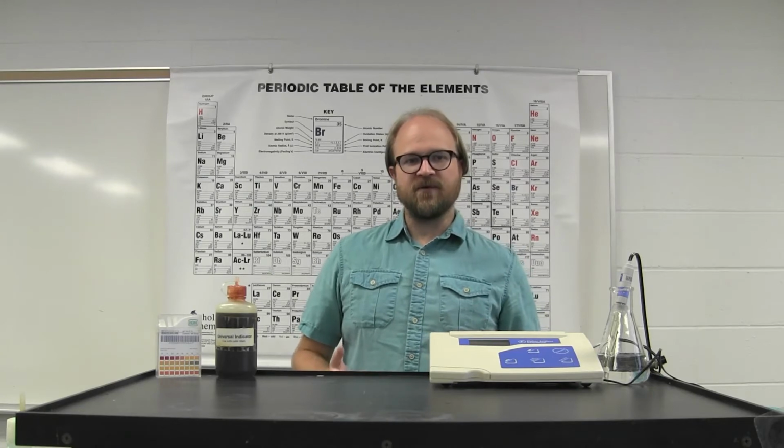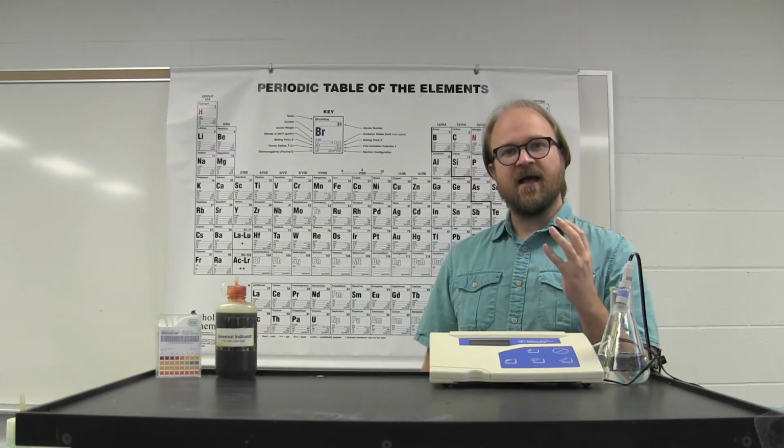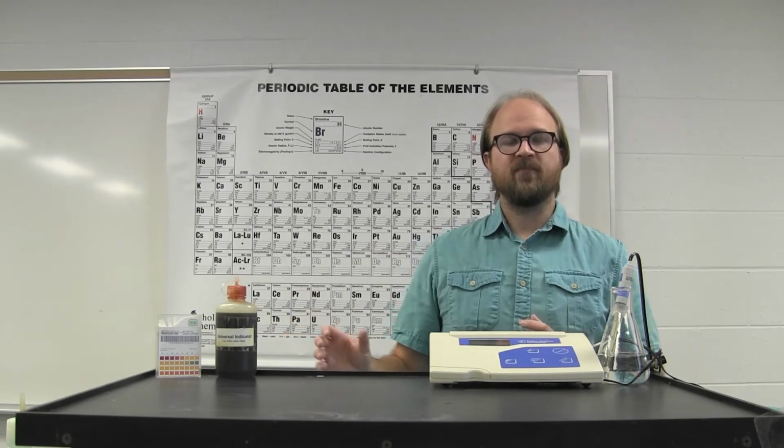This second experiment that's focusing on acid-base chemistry is a little bit more in-depth than the first one that you did for the last experiment. In the last experiment, you were looking at the overall chemical reaction of an acid and a base: the H+ acid ion reacting with the OH- base ion to form water.